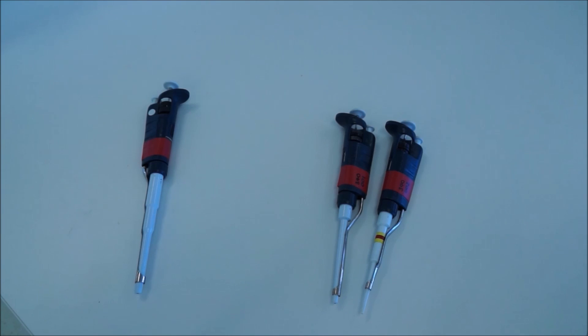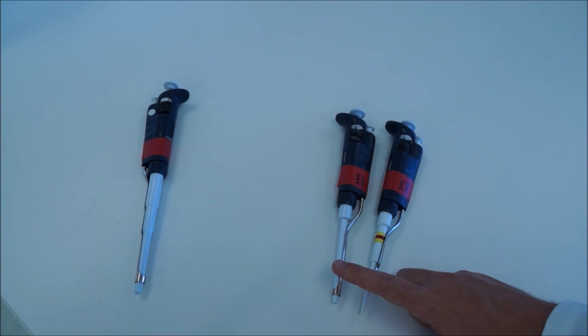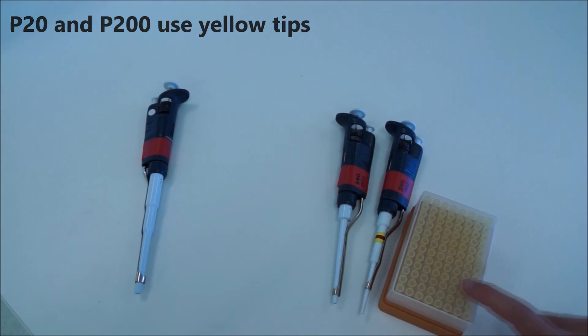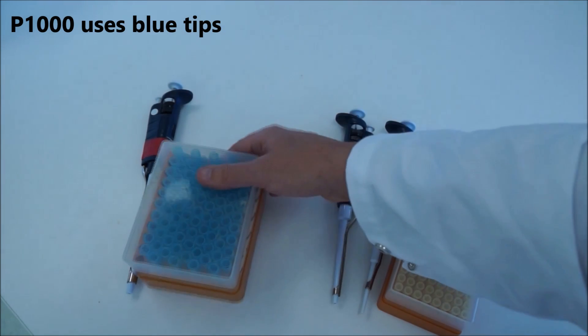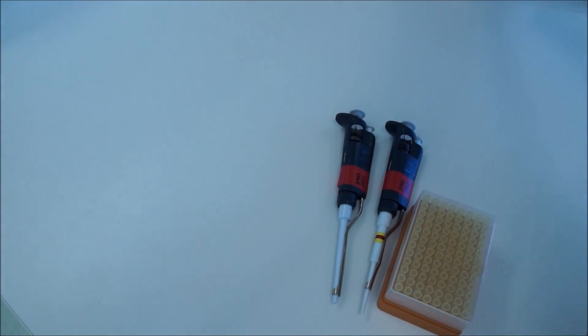Whenever you're using pipettes, you need to use a disposable plastic pipette tip because you don't want to get any contamination inside the actual pipette because we're reusing this. You can cause contamination in future experiments. So the P20 and P200 use yellow tips and the P1000 uses blue tips. We won't be using these today.